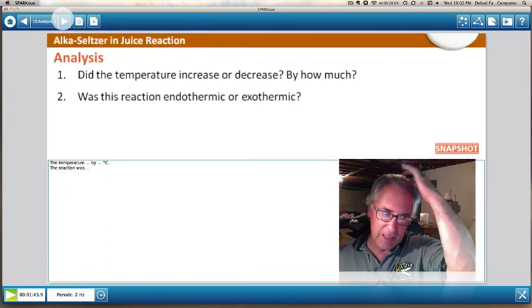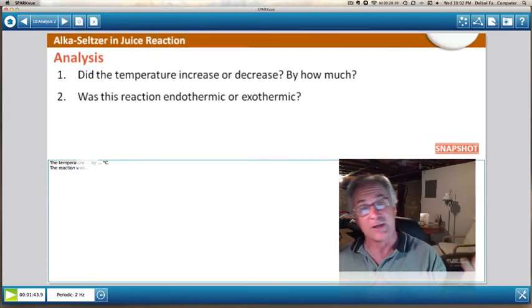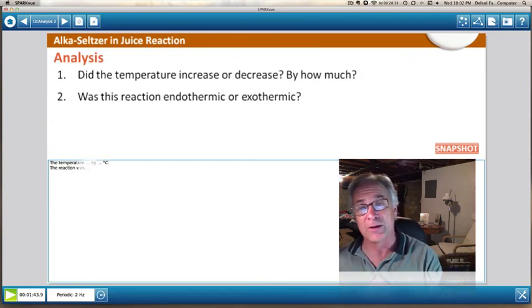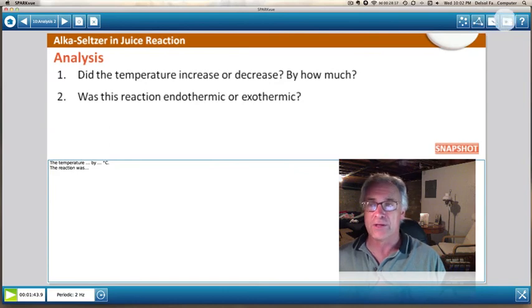Now I'm going to go to the next stage. So we're going to take a look at the analysis. It says the temperature, did it increase or decrease, by how many degrees Celsius. So the reaction is what? Exothermic or endothermic. You're going to take a snapshot of that.